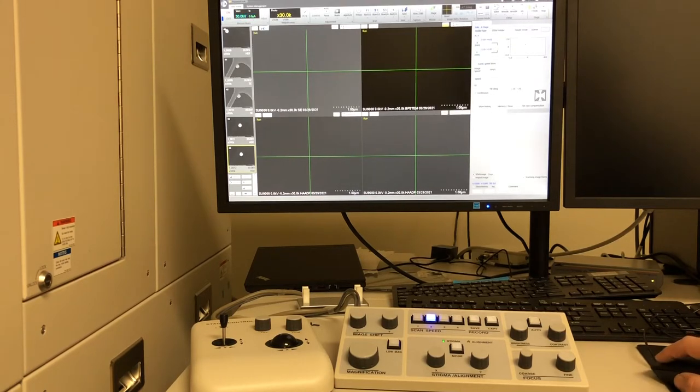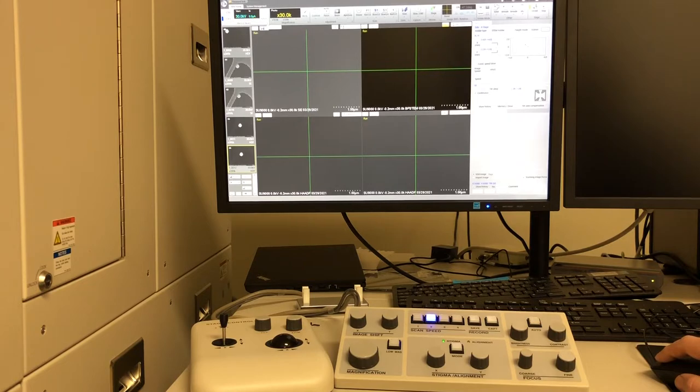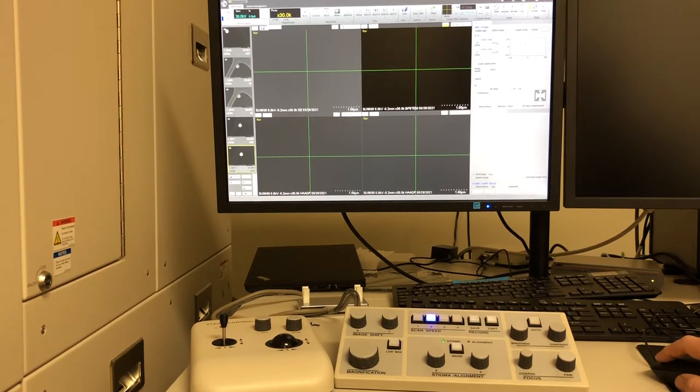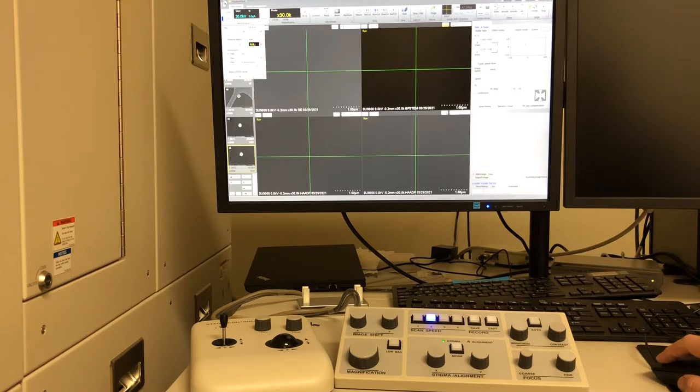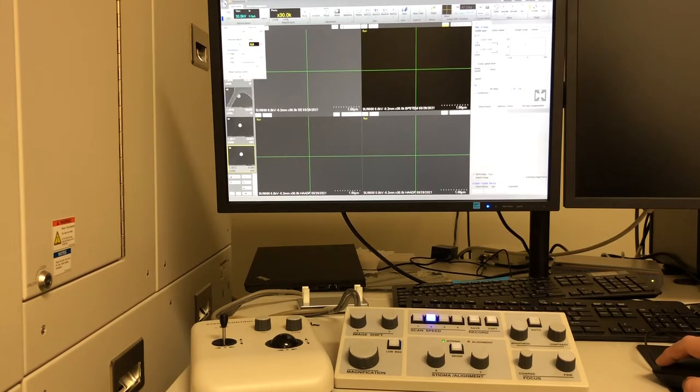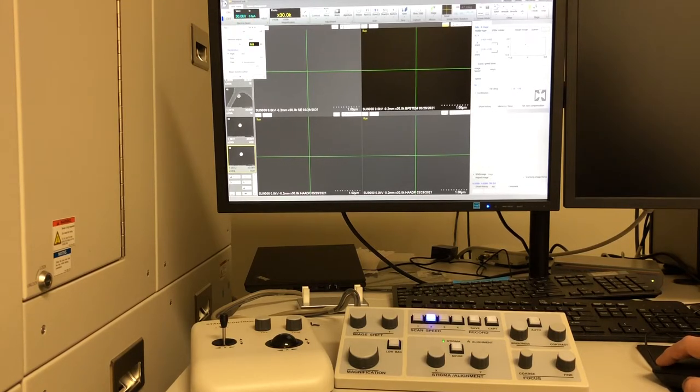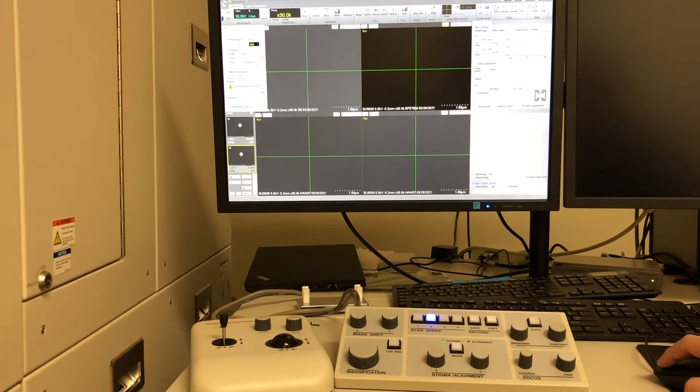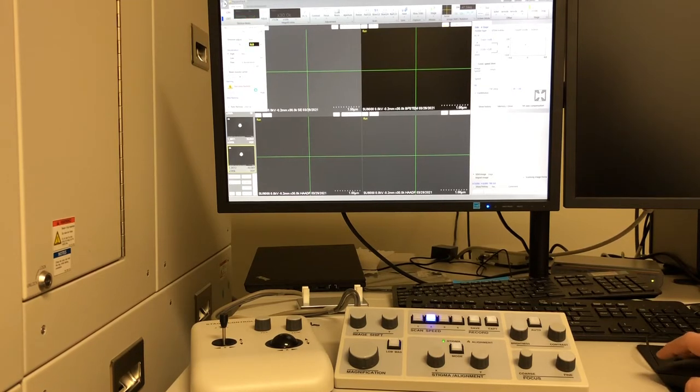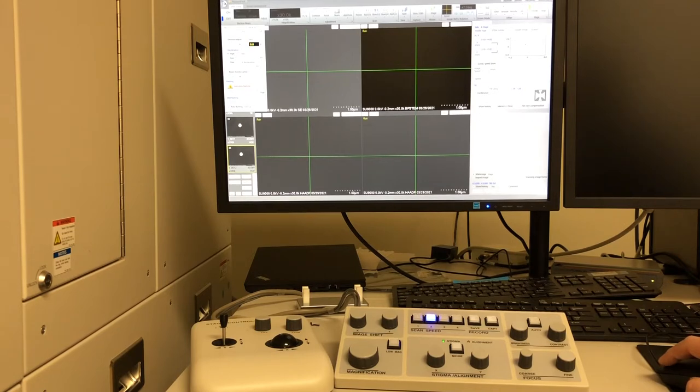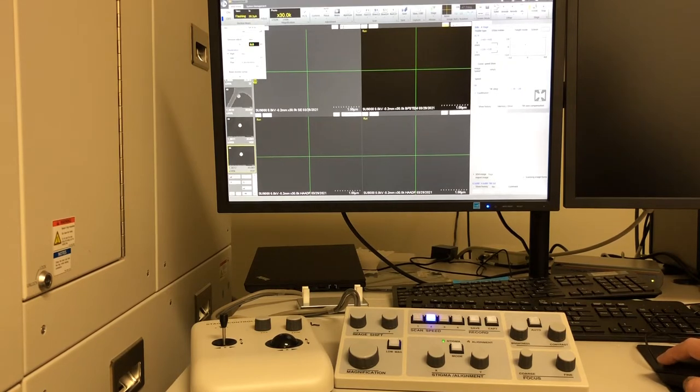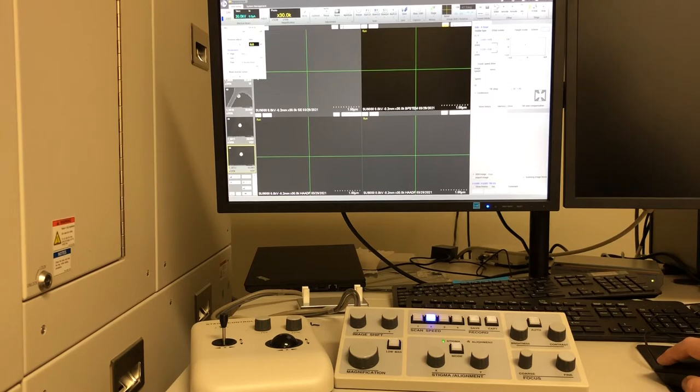The next thing I will do is come over to the Electron Beam window, open it, and then I will do a flashing as I'm the first user of the day. Then press execute. This will take a couple of seconds to perform. Press close.